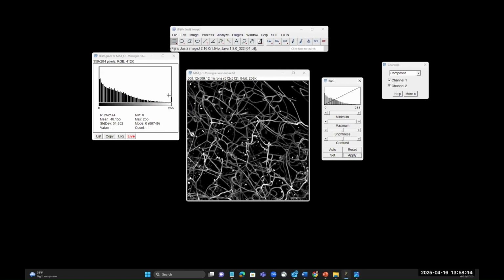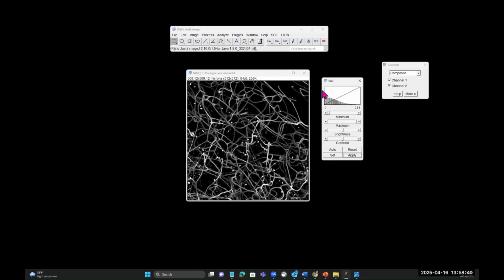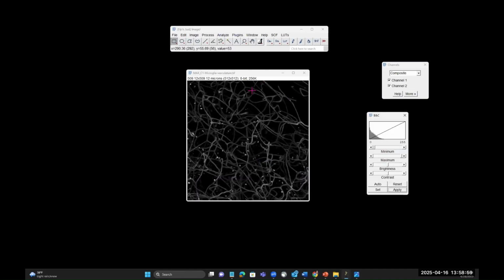You're going to see a whole lot more pixels that are saturated. So this is basically clipping your image, because you have changed the values of your pixels already. So before analyzing your images, never do the Apply here, actually, to change how this is displayed.